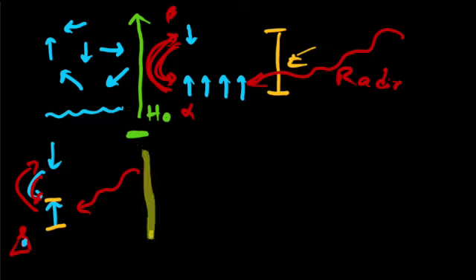Okay, now let's separate that from this other situation. Now let's take our magnet, remember this is just a hydrogen. These are all hydrogens inside of my molecule. And it has this size of magnet for that little hydrogen nucleus.